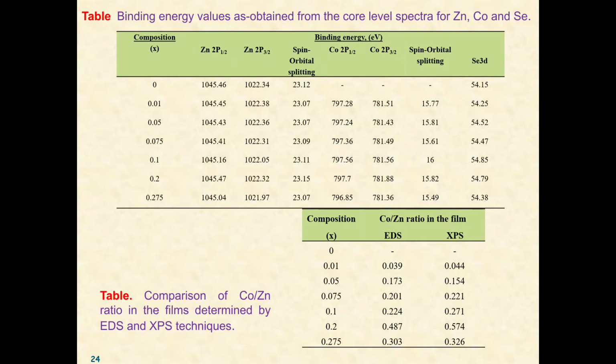This is the tabular form of XPS measurements, as we can see in table number 1, and in the second table there are the values from EDS and XPS measurements. They roughly match.